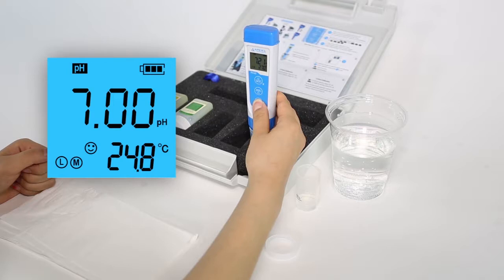If the reading is not close to 7.00 — for example, it is 7.2 — you will know it is time to calibrate the probe.